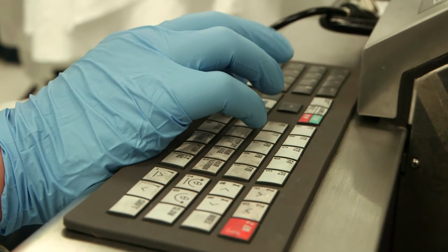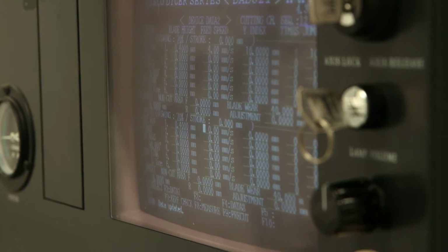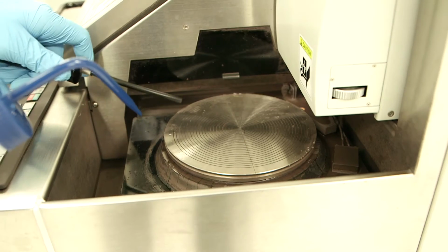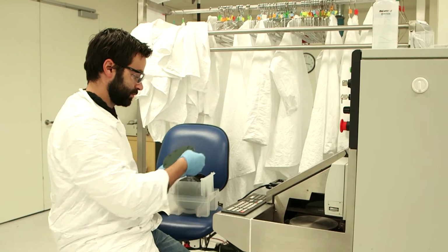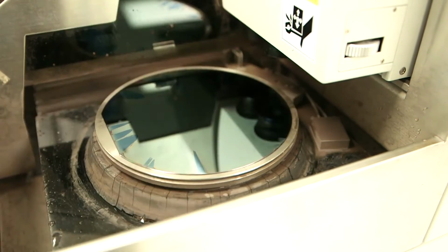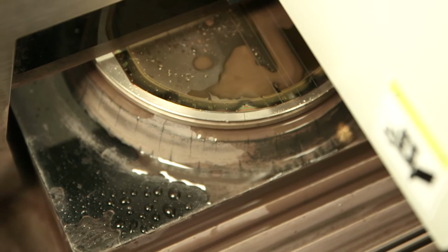Throughout the course of the research that I've done here at Harvard, I'd say I've used about every machine in this facility. We're making a toolkit for cells in the same way that a doctor has a toolkit for studying your body. And it turns out, because of the size of an average cell, which is about 10 microns, that we need to make structures that are on the size of microns to nanometers. And it turns out that this technology that we've been doing has been successful enough in perturbing cells that it's opened up new avenues of biological research. So these little needles that we've started creating, these nanowires that are coming off the surface of silicon wafers, are now being used at other institutes, for example, the Broad Institute over by MIT.